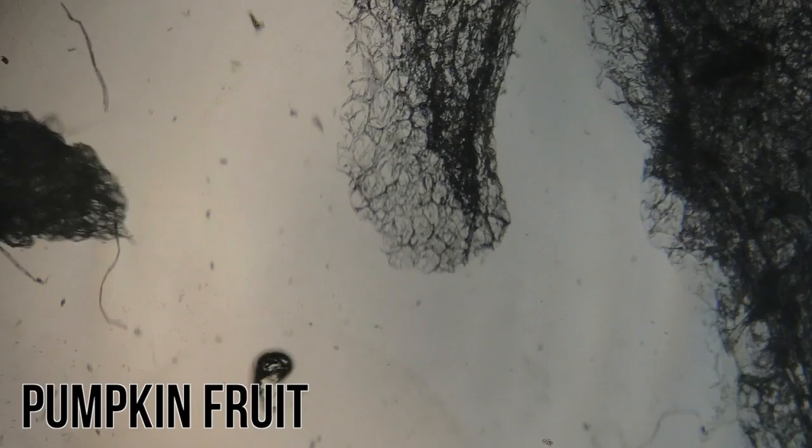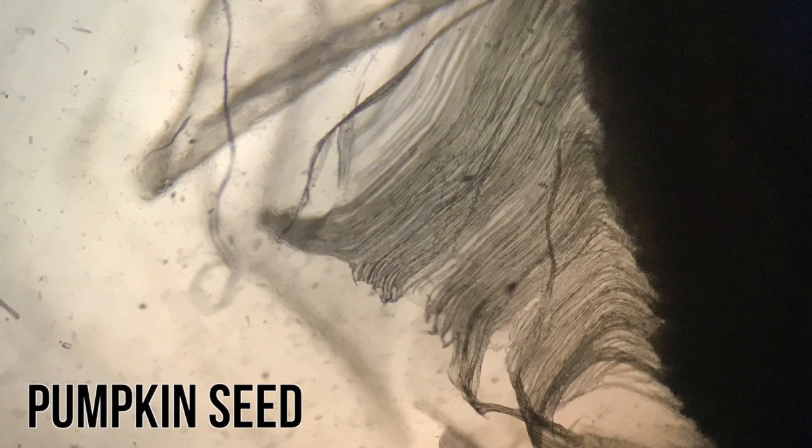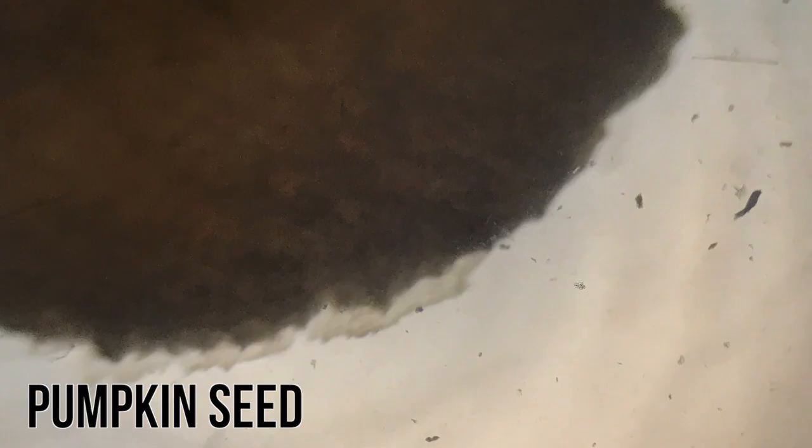Here are the images from the pumpkin fruit. Here are some images of the pumpkin seed. And here are some images of the pumpkin fiber.